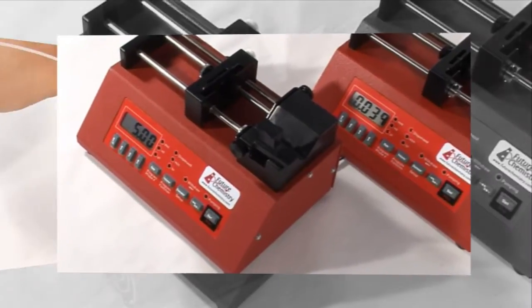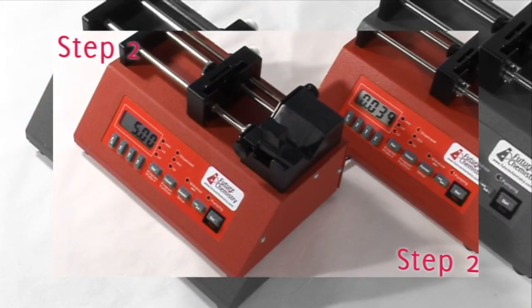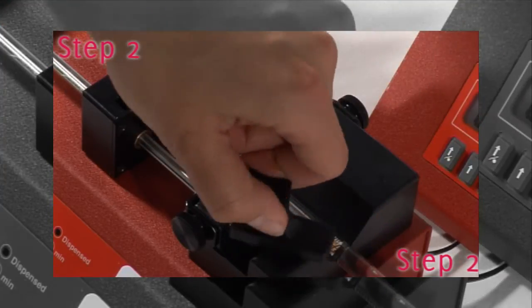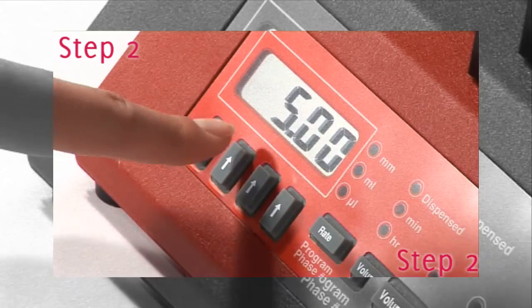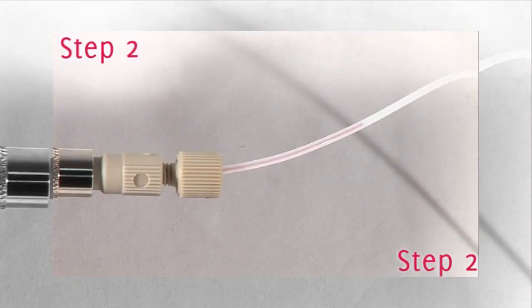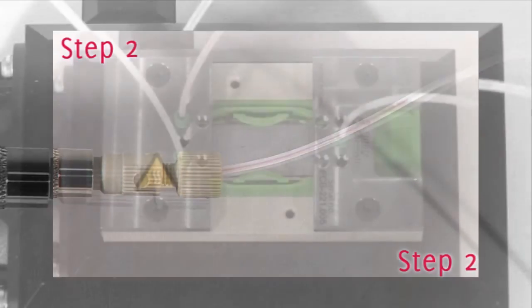In the second step, the tubes are connected to two syringe pumps. Syringes filled with your reagents are placed into the pumps. The pumps are set to the desired flow rate and started. Now a continuous flow inside the micro reactor has been established.